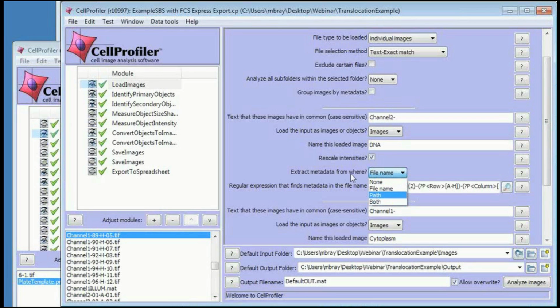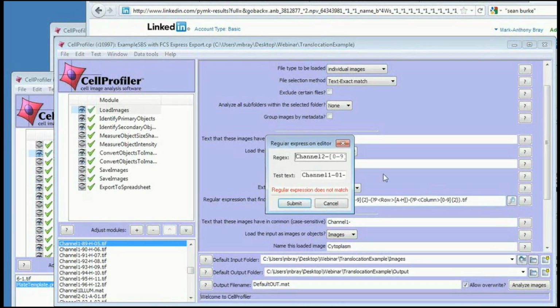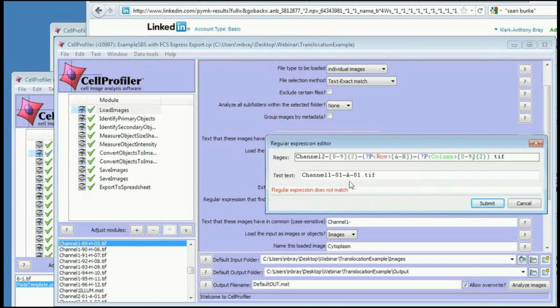And you'll have boxes for each one, or both, depending. What this essentially is in this edit box here is what's known as a regular expression. Basically, it's a type of language that allows you to grab text of one type or another. Let me try to show very briefly what this indicates here.